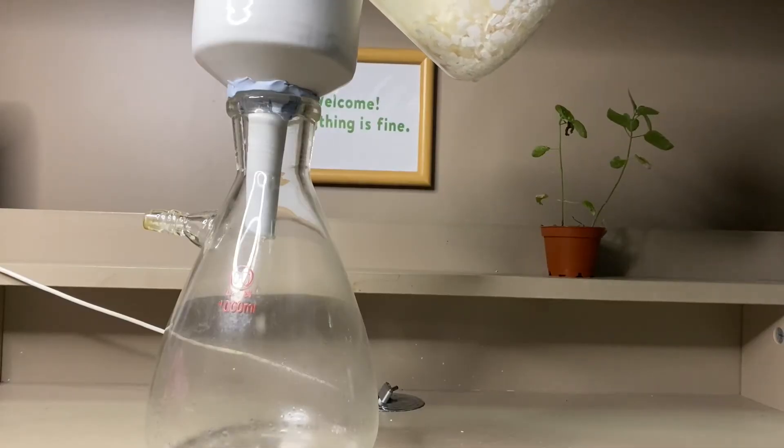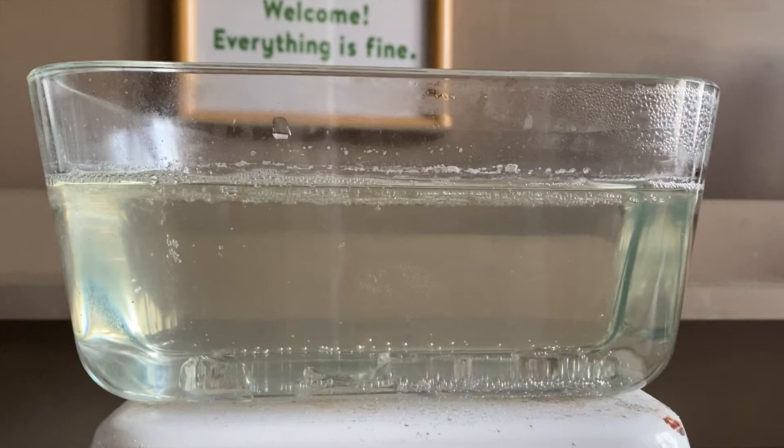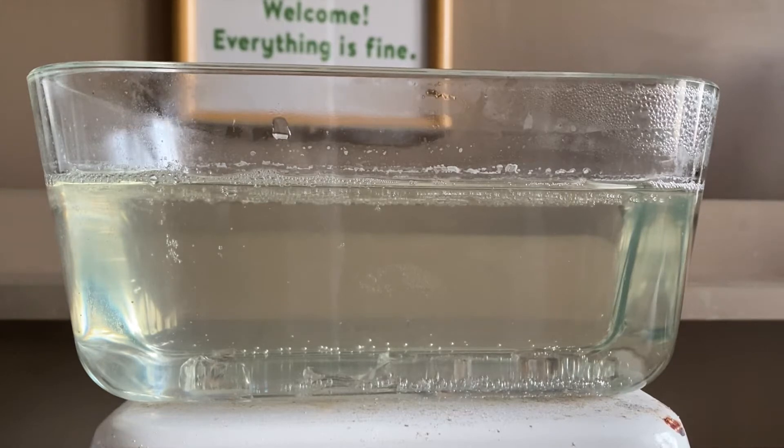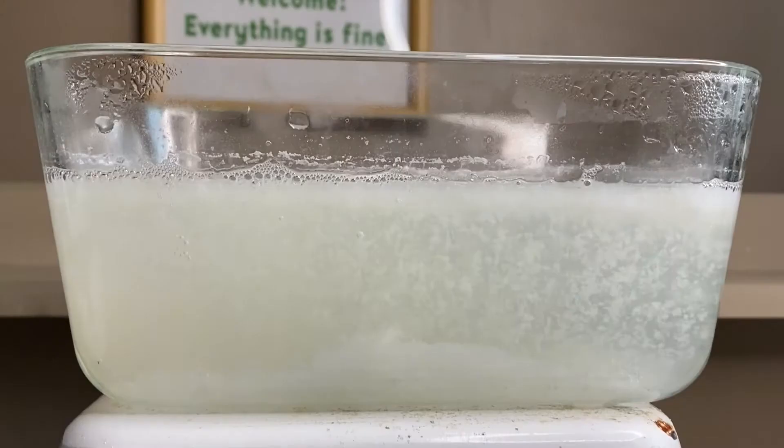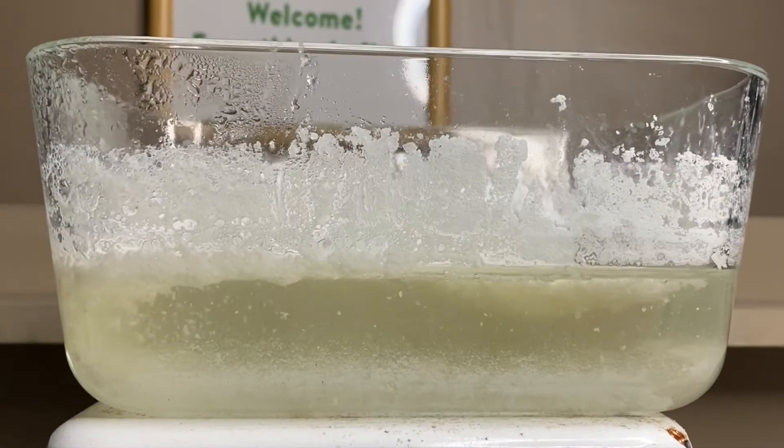After some time, we filtered the unreacted eggshells and obtained a clear solution of calcium acetate. We proceeded to boil it down in order to obtain calcium acetate solid.